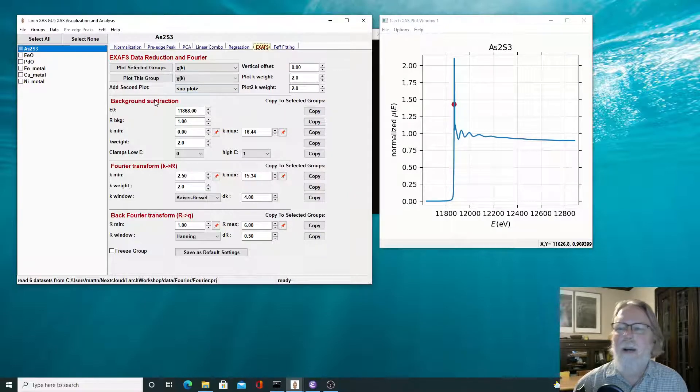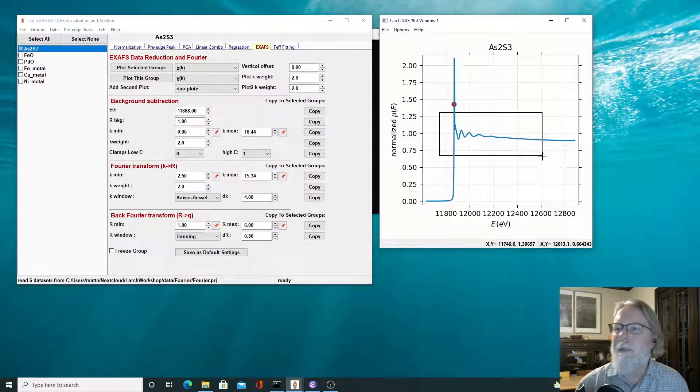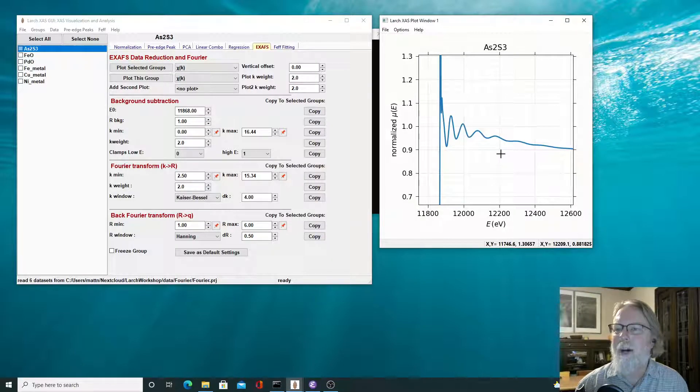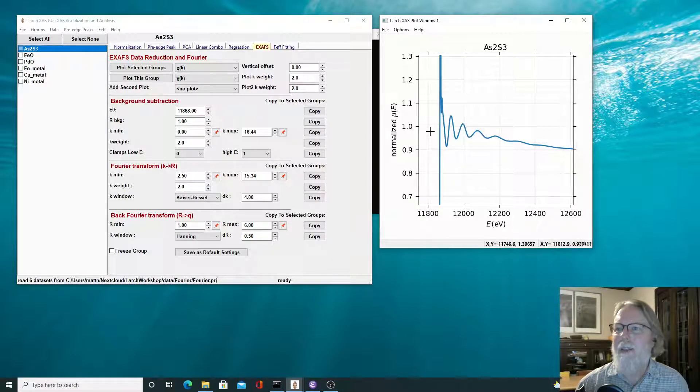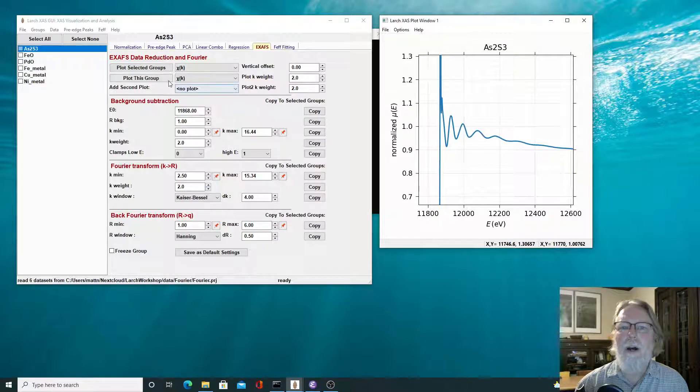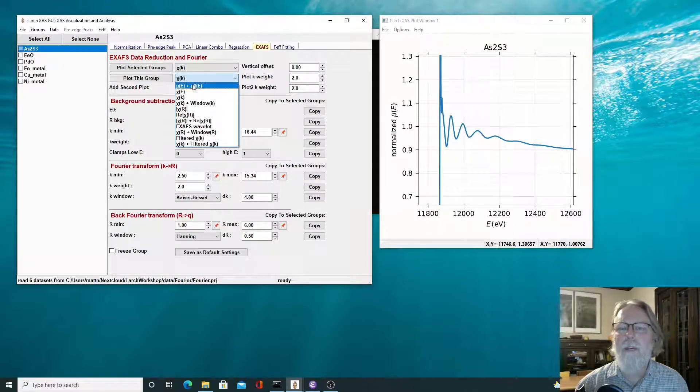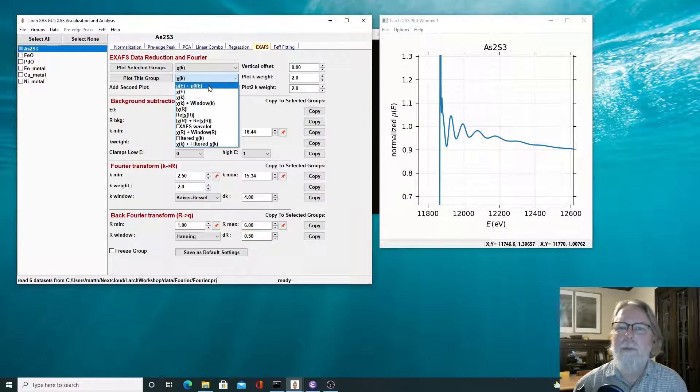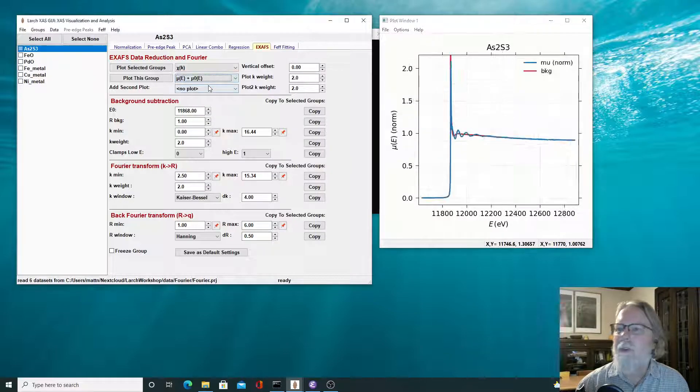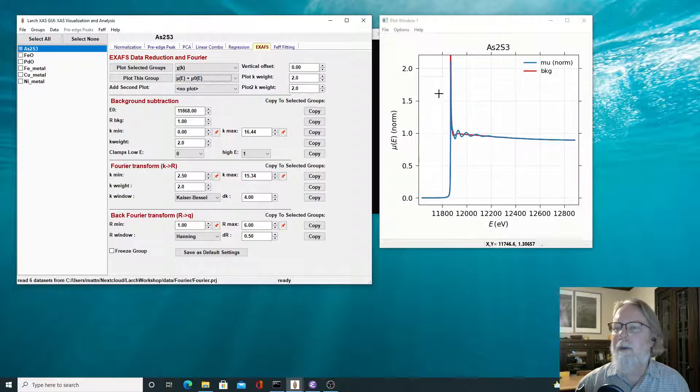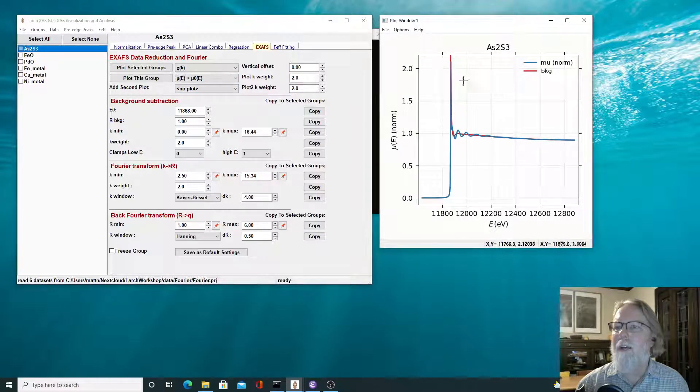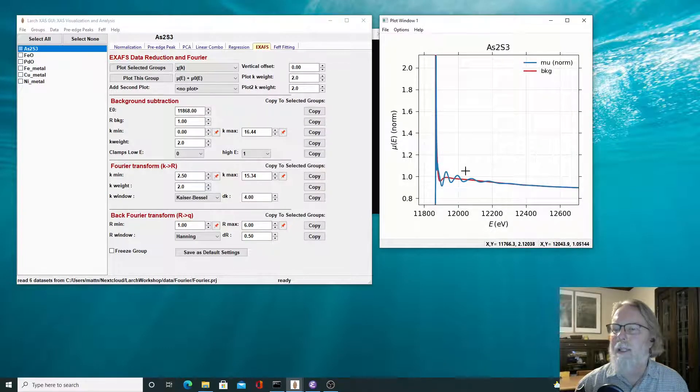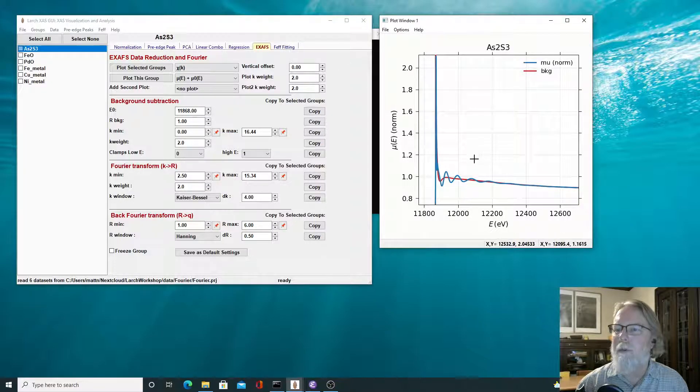It's the same one we used last time for the Fourier analysis, and here we're just going to be focusing on the plotting section and this portion here called background subtraction. In fact, if we look at these oscillations, if we blow them up, we see that there's a nice periodic oscillation above the edge, and that's going to be our XAFS.